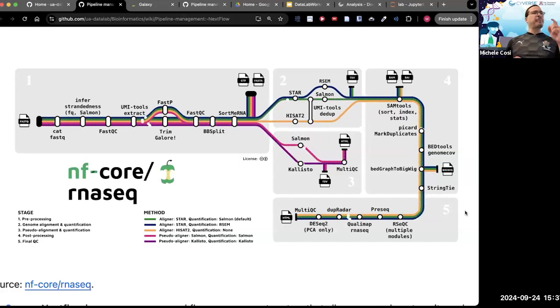And you have a question? Yes. Are you using channel and stage kind of interchangeably? Is stage the same thing as channel? Because on this graphic it says stage. Right now, yes. Okay, because it says there are 5 stages. Yes. In this specific case, yes.